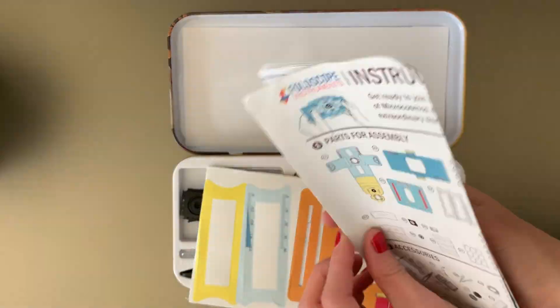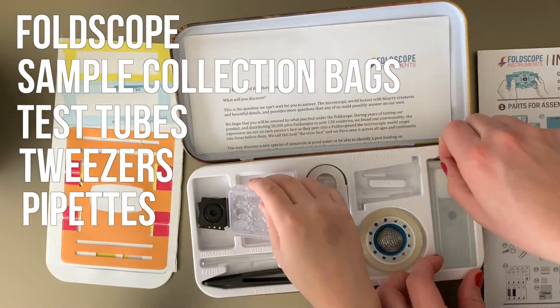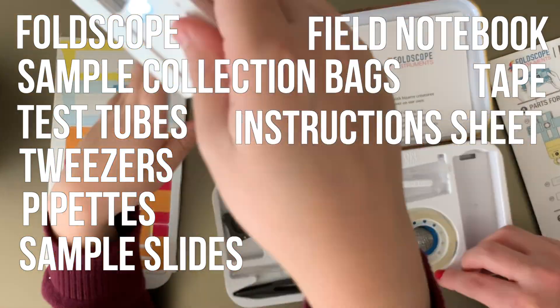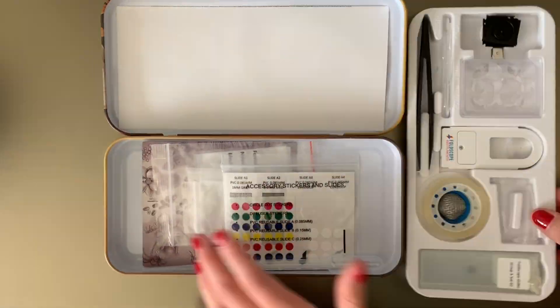The kit that I was using included a Foldscope, sample collection bags, test tubes, tweezers, pipettes, sample slides, a field notebook, a roll of tape, and an instruction assembly sheet. This kit pretty much has everything you need to start your own lab at home.